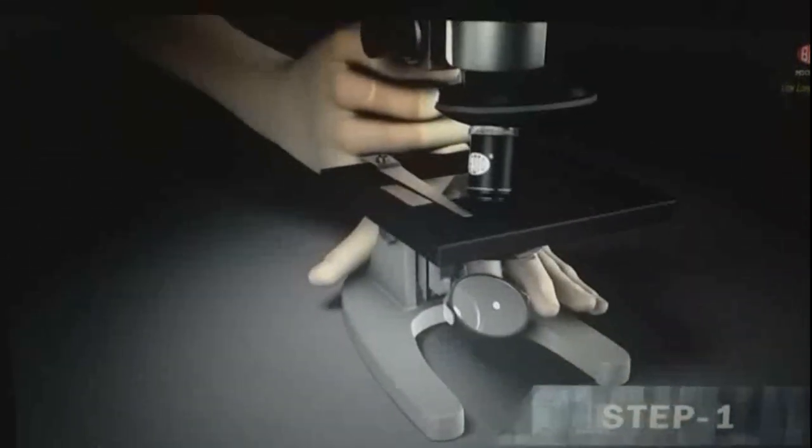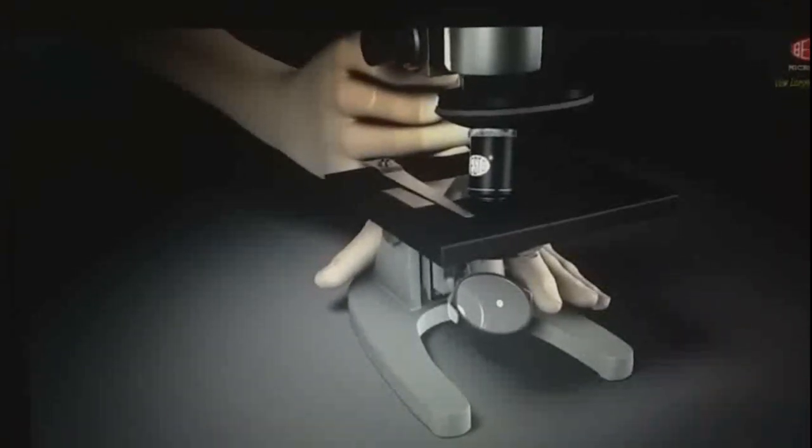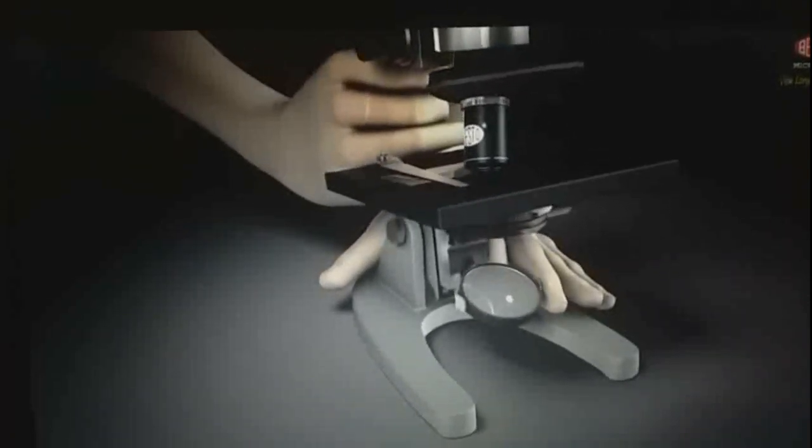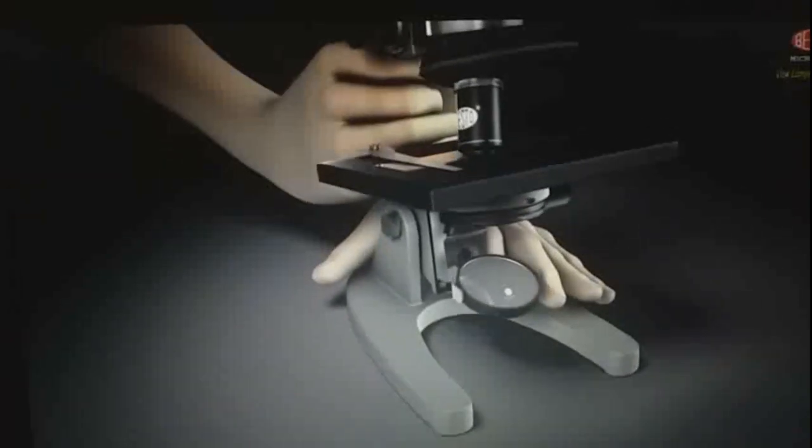Number 1. Remove the microscope from the cover. Pick it up and grasp it firmly with both hands, one hand under the base whereas the other hand on the arm. Place it on the table away from the edge. Move it to the position through which you look comfortably. You can tilt it while sitting.